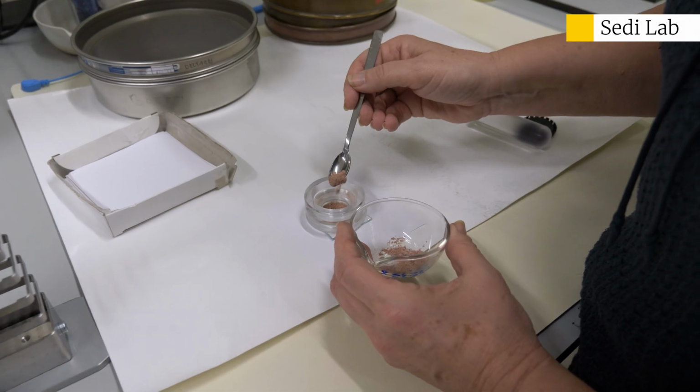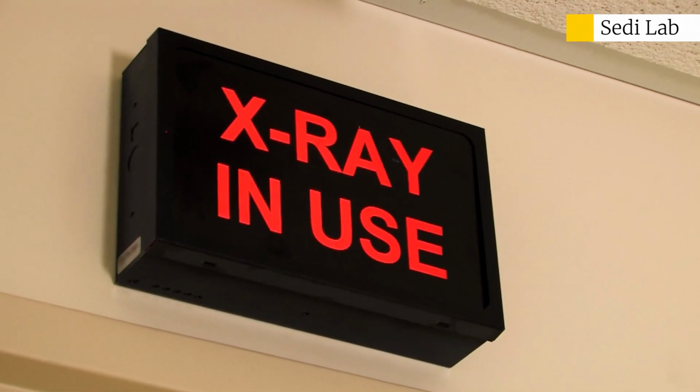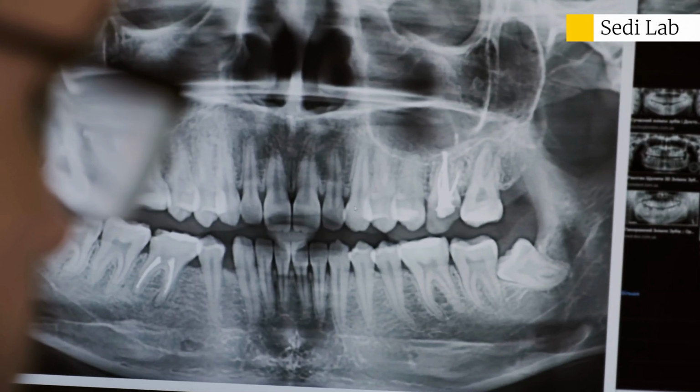This is the Sedimentology Laboratory, and here we study different natural materials to see what kind of minerals are in these samples. I think everybody knows that X-rays do not reflect but penetrate the material.